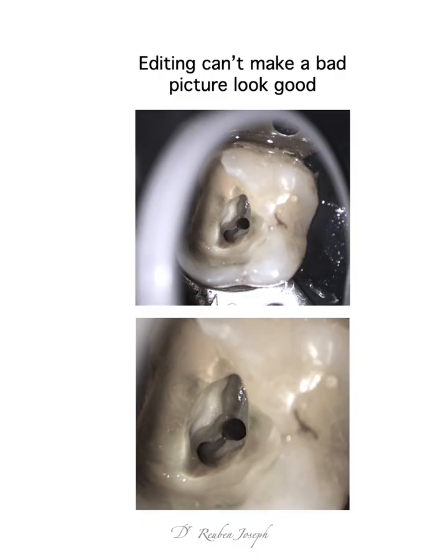So in continuation with what we had discussed earlier, unless your documentation setup is good, you cannot afford to crop and get too close to the subject of interest like in this picture. One other question I get a lot whenever I share my pictures is, what do you do to edit your images? The answer to this is very simple. I hardly do anything at all, and the fact remains that a bad picture can never be made a good picture by any amount of editing. We can only refine the existing picture to a very small extent, probably about 10-15%. That's as far as it goes.